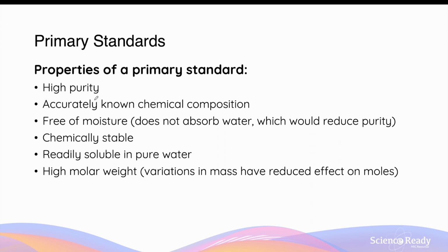A primary standard should ideally have a high molar mass or molecular weight. The number of moles of a substance is given by its mass divided by its molar mass.